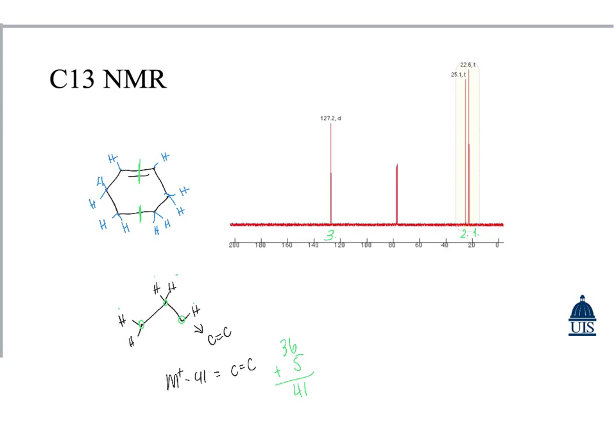Now that we have confirmed the presence of the double bond, we can now match the different carbon environments with our image. The first carbon environment that we see is this one right here, because it has the double bond, and each carbon in this part of the structure has just 1 hydrogen attached to it, meaning one that was deshielded, so it's going to be the farthest away from the other peaks, matching up with carbon environment number 3.